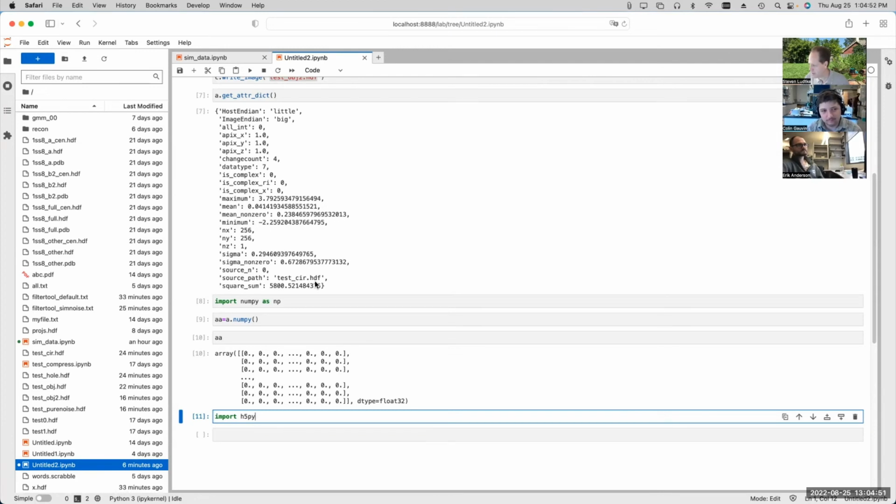many different people have modified the standard on their own over the years and used it for incorrect purposes. Right, so people have added, oh, I'm going to use the extended header with my header, and then someone else says, oh, I'm going to use the extended header with my header, and there's no way of identifying which of the headers are there. So when you read the file, you have to somehow look at it and figure out which type of header it is.